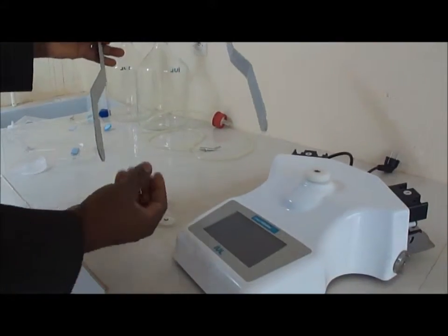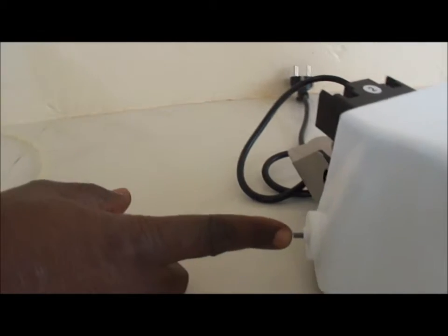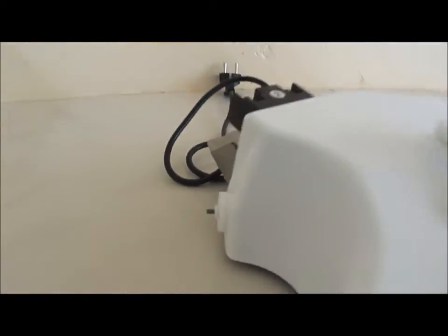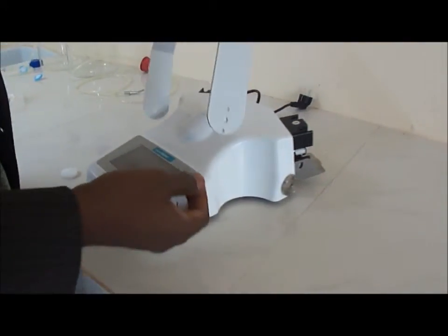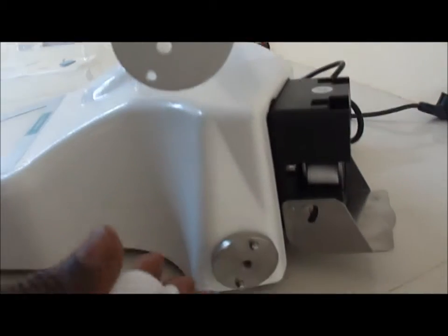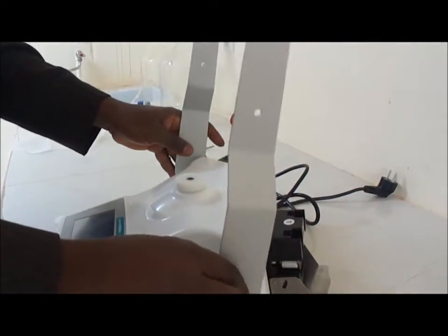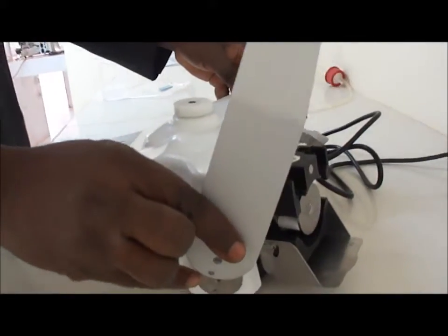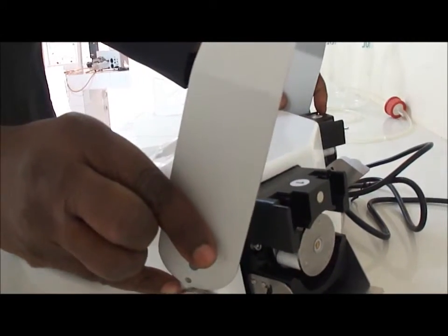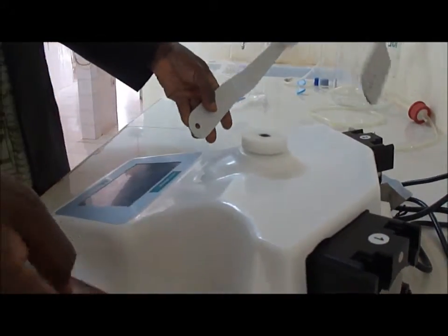You have the accessories, this small disc, that will be mounted on this side. As you see here, you have a small stick in which it can be screwed, and the other one has its own screw. You have to be careful. You have two small sticks here coming into the two holes, and then you have this screw that will be mounted on the center. And you will see in a few moments that this frame will have two extreme positions. One is at the back, and the second one on the right. In the back position, it will stop the pumps, and in the right position, the pumps will work.